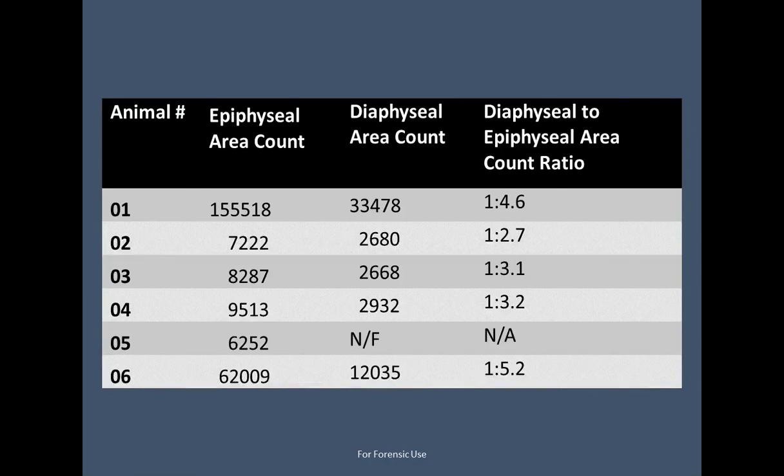And so what we also can measure is the type of bone, and we can measure the ratio in that type of bone, and that ratio can tell us a little bit about the toxicity performance and why toxicity would be there. There's a lot more work that needs to be done on this to really understand what that ratio means.